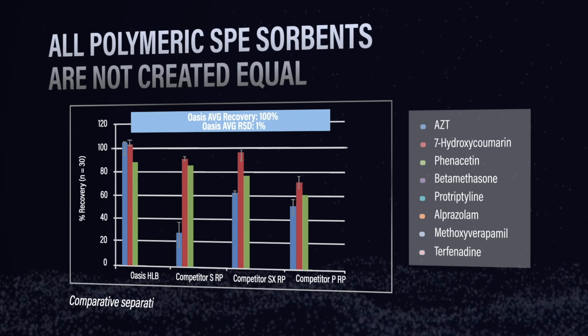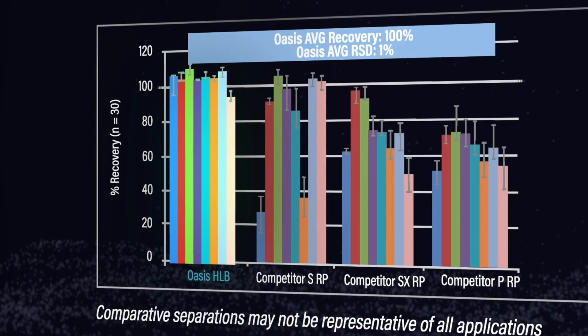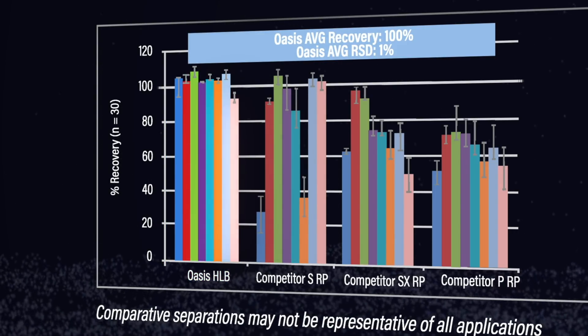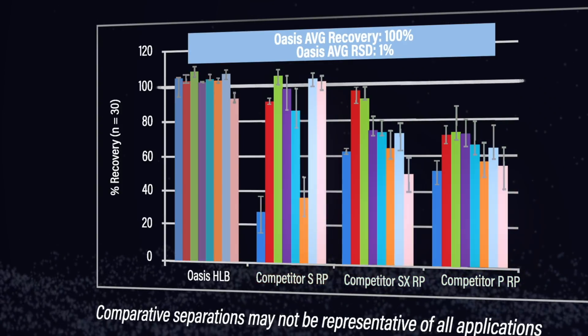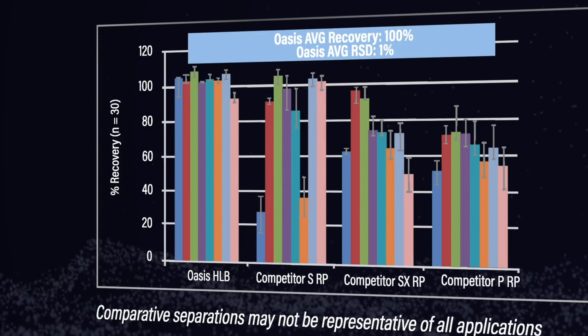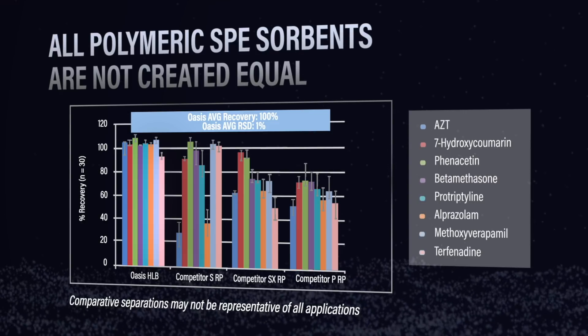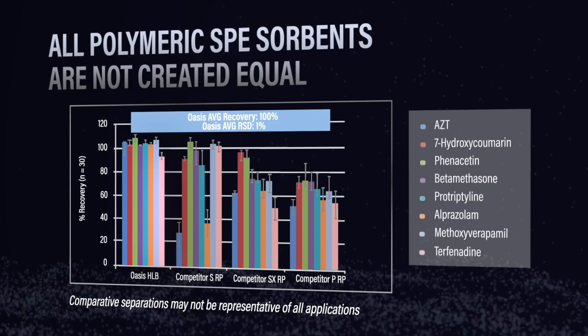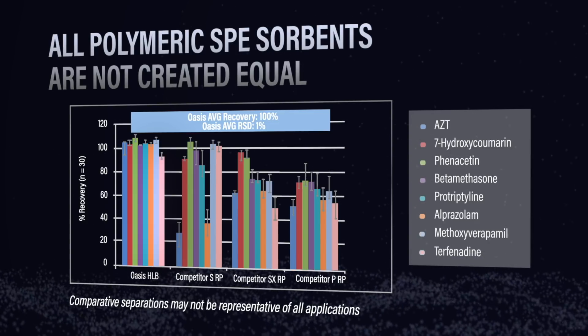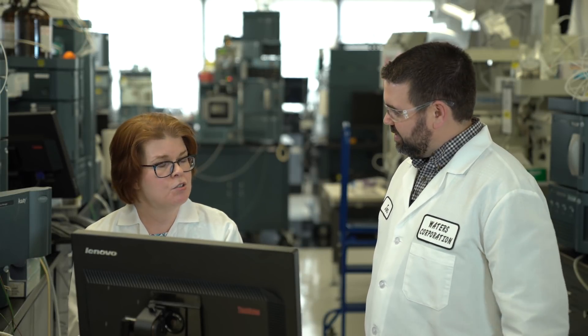In our second experiment, we ran these same sorbents without the conditioning and equilibration steps. What we can see is that one of the sorbents worked really well, which would indicate that it's truly water wettable — but the other three did not. They have much lower recoveries, and the big problem is much greater reproducibility issues; the RSDs and error bars were a lot higher. You can imagine how this plays out in the lab: if wells or cartridges are flowing at different rates, or drying out under vacuum or positive pressure, you get the same kind of reproducibility problem.